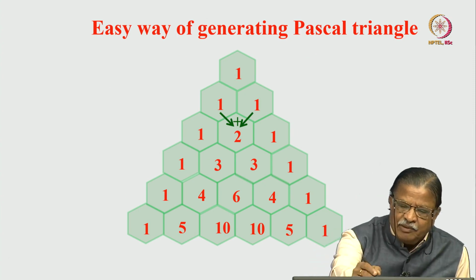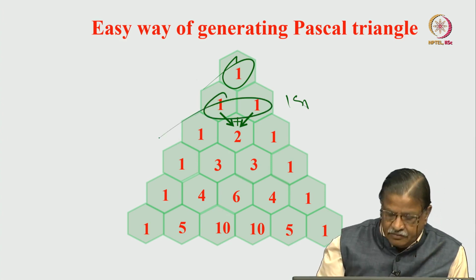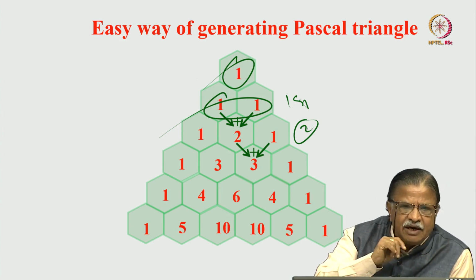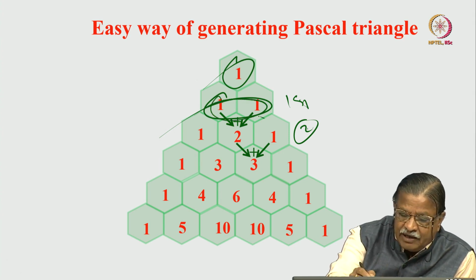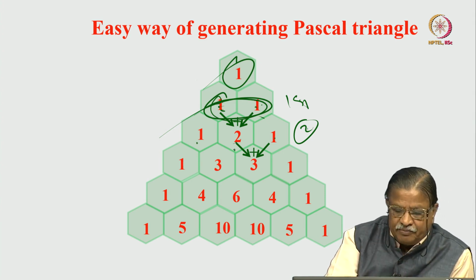Like first you put one single spin, not coupled to anything. It is coupled to another spin, each becomes 1 and 1. In the third case, when you bring in two other spins, one spin plus another spin, 2 spins. How do you generate the intensity? Add the intensities at the top of that, 1 plus 1 you add to get 2. This one you retain here, this one you retain here. Only these two you add up and it will become 2.